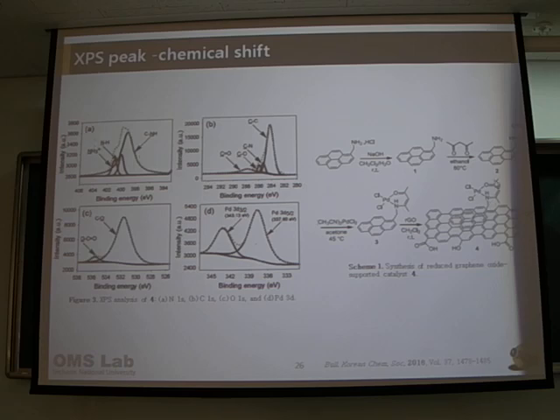Normally, if the compound is an ammonium compound, the XPS peak sometimes contains the NH3 plus like this. Say it again. What was it? If we do the deconvolution or the high resolution, then we see that if an amine group is there, the amine group sometimes changes to NH3 plus, and it shows some peak. Almost always we see this one. You're saying that the ammonium peak usually occurs for pretty much all the amines? If the compound contains amine, then XPS shows the NH3 plus.